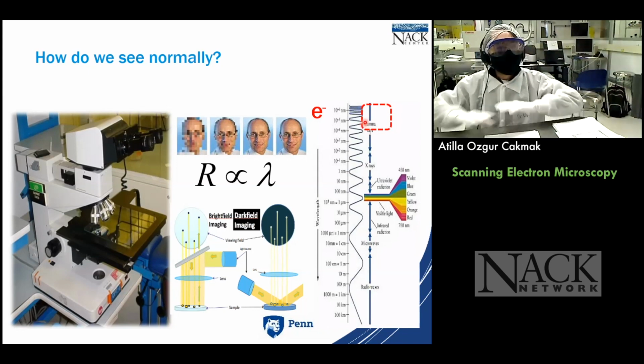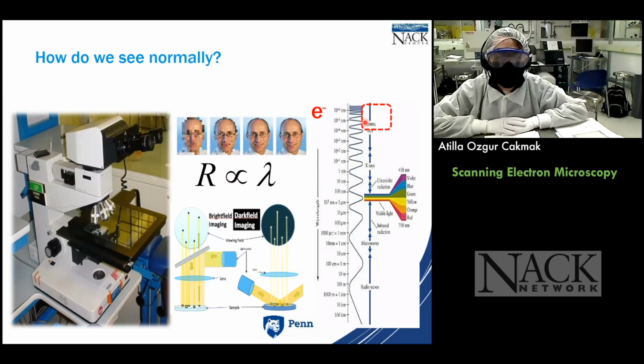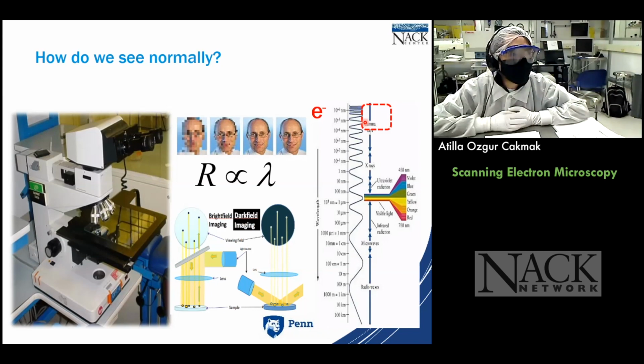Yes, the whole compact information about all those complicated discussions about quantum mechanics boils down to one significant outcome: that there are quantum particles that show both wave phenomena and particle phenomena. So a lot of us might think of electrons as particles, and that is perfectly right. But they are waves as well.